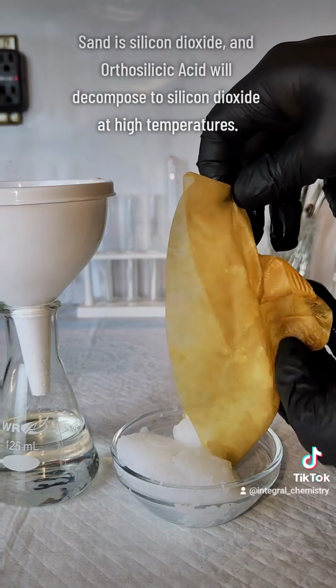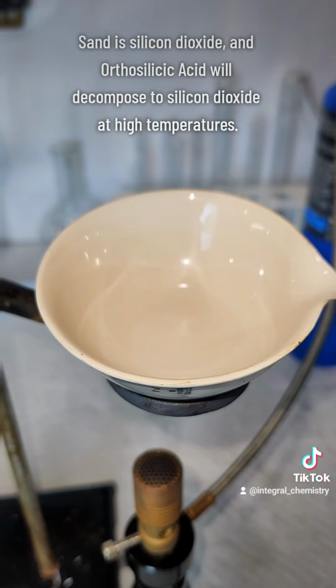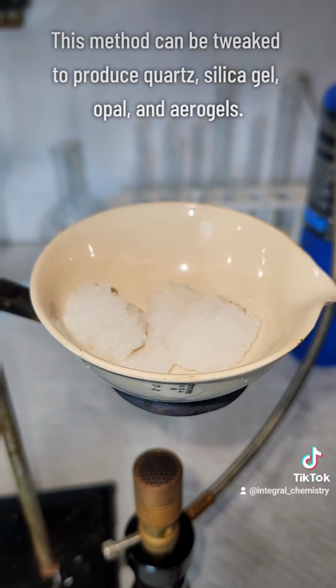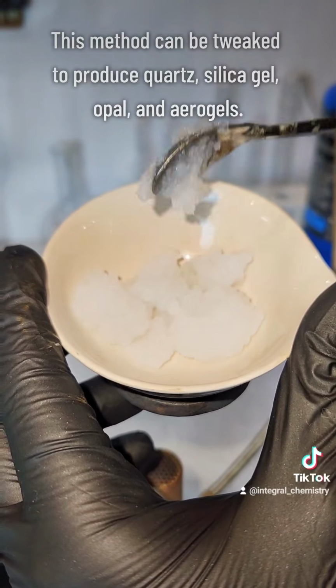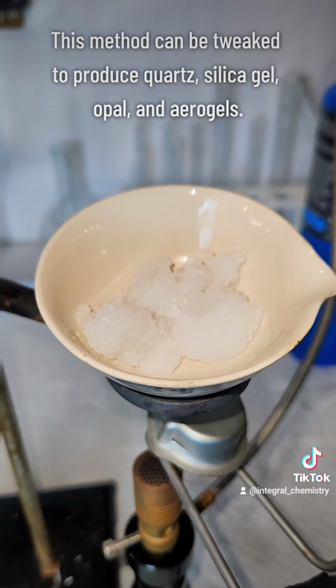The orthosilicic acid is then transferred to a ceramic or porcelain dish for the final phase of this process. Now, to finally make my silicon dioxide, I'm going to heat my orthosilicic acid to decomposition, which is going to drive off moisture and leave behind silicon dioxide.